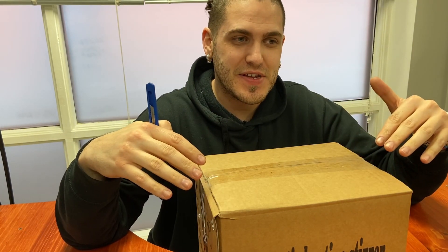This is going to allow us to plate and effectively polish our pieces in a very non-destructive way. Let's get into this box. This is just one part of many that we're having to buy for plating. Plating is not something I'm jumping into lightly — I'm not going to just run a 9-volt battery through some vinegar and call it plated.